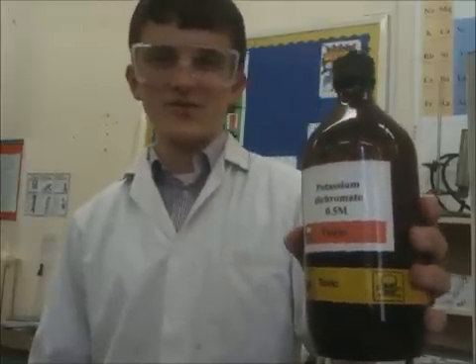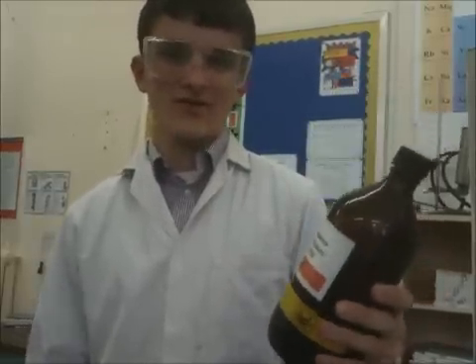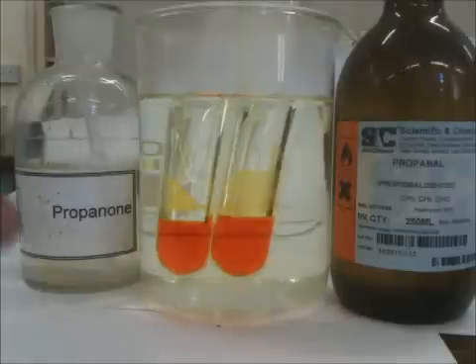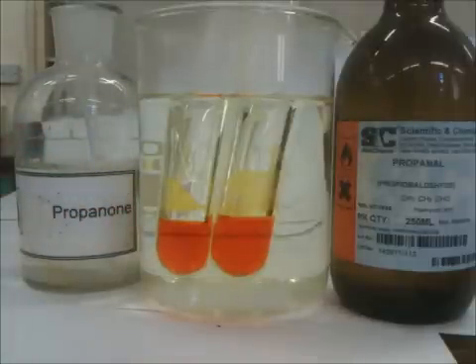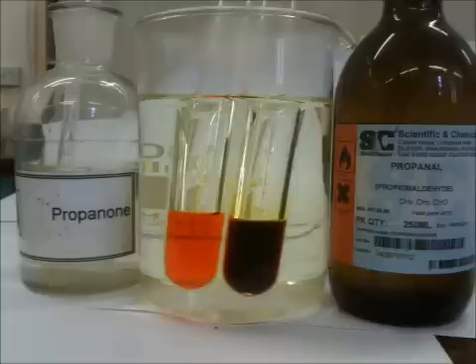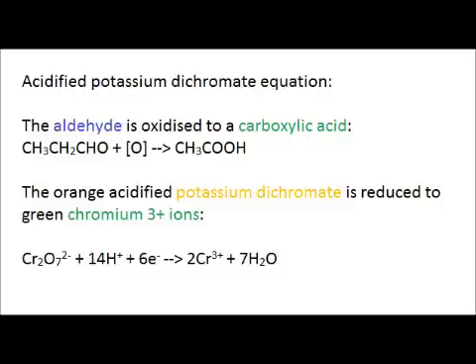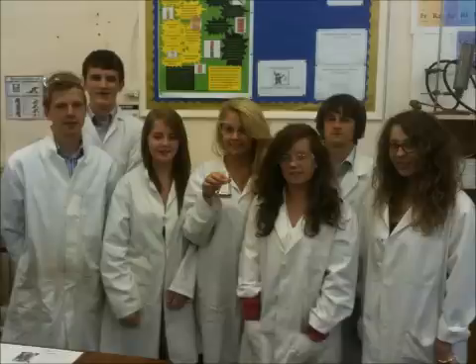Acidified potassium dichromate is a strong oxidising agent, which we can use to distinguish between an aldehyde and a ketone. We have warm acidified potassium dichromate, propanone and propanal. It has now gone from orange to green as the aldehyde was oxidised to a carboxylic acid, whilst the orange potassium dichromate becomes the green chromium 3+ ions.